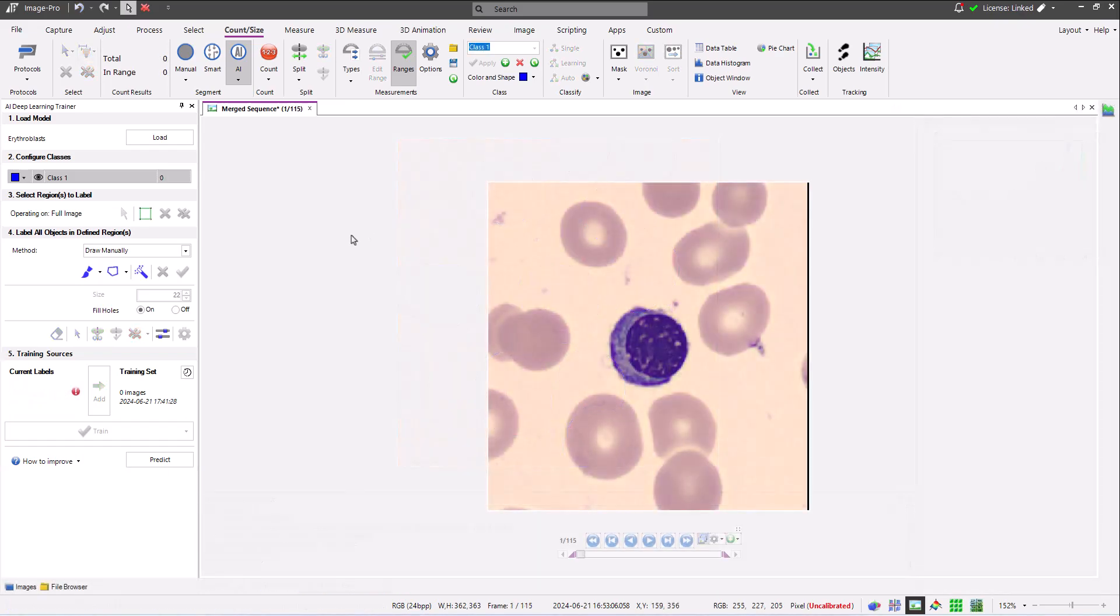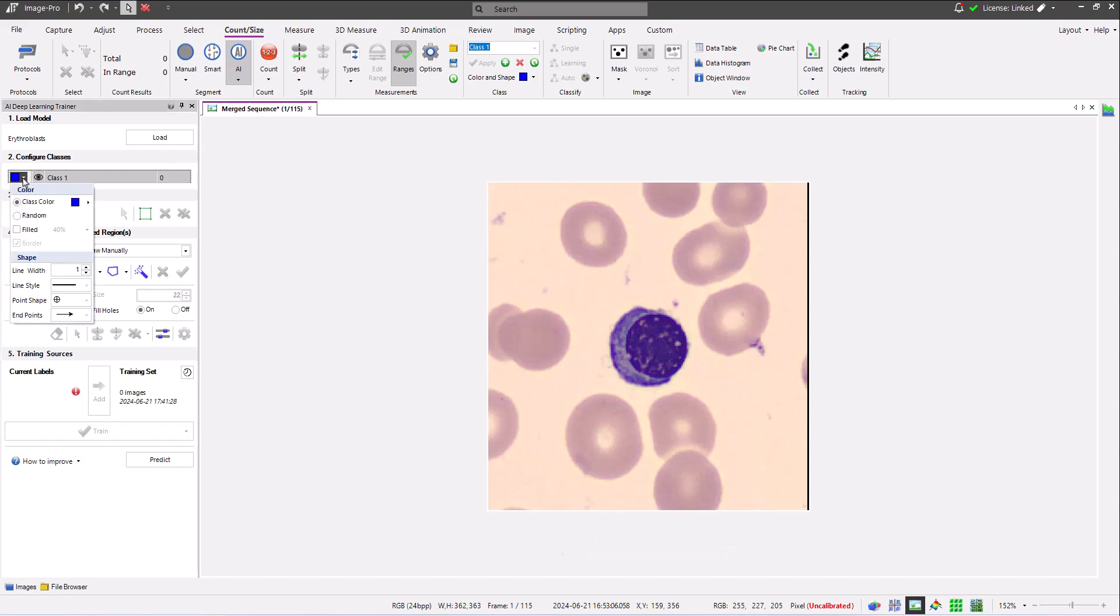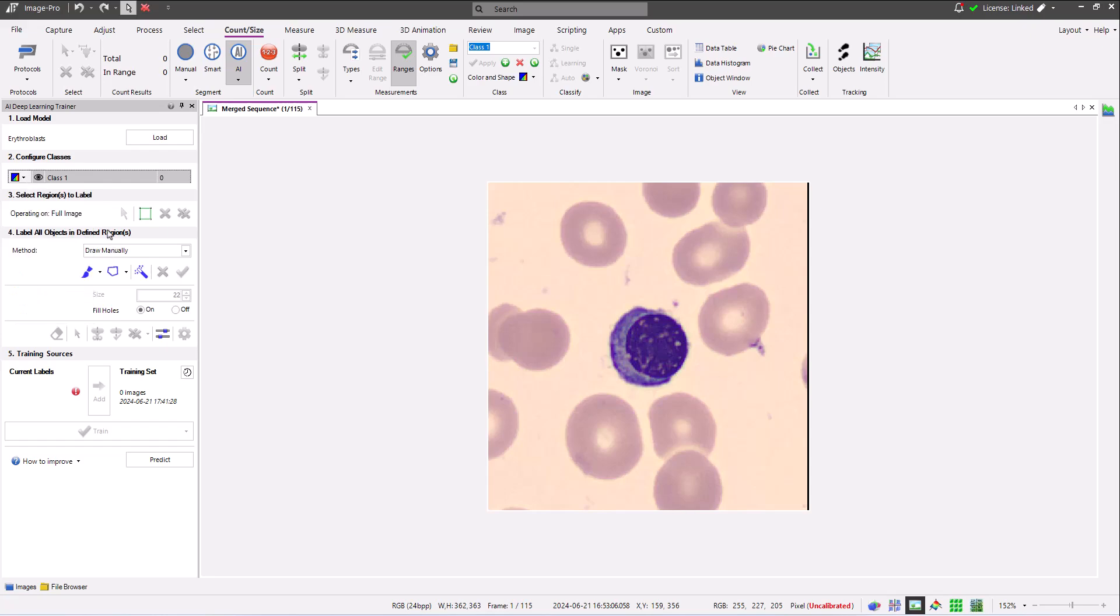Let's make a start adding training data. After configuring the appearance and class name of my training objects, I can begin adding labels. Each of the frames of the sequence of images I'm using as training data contains only a single erythroblast, so I'm not going to add a region of interest.